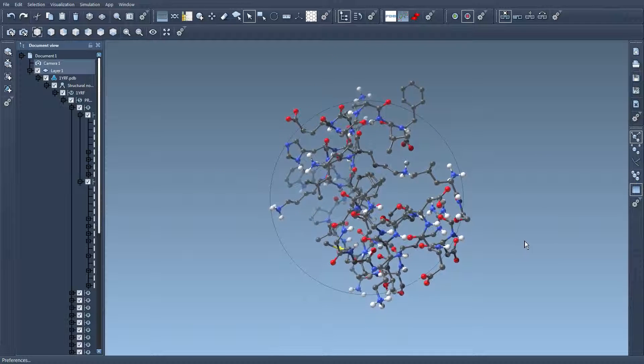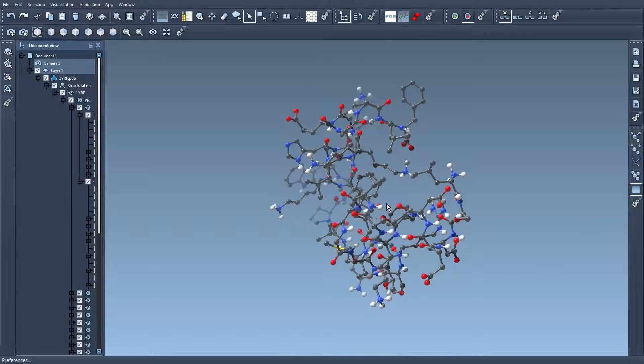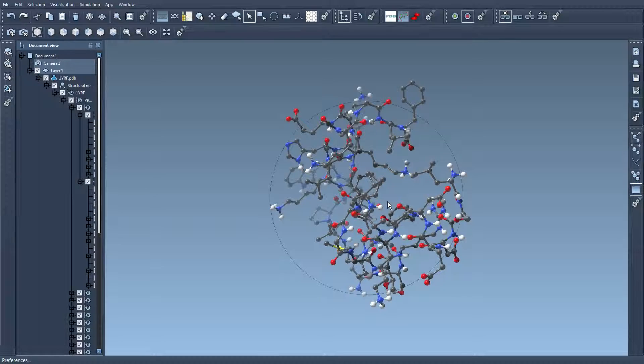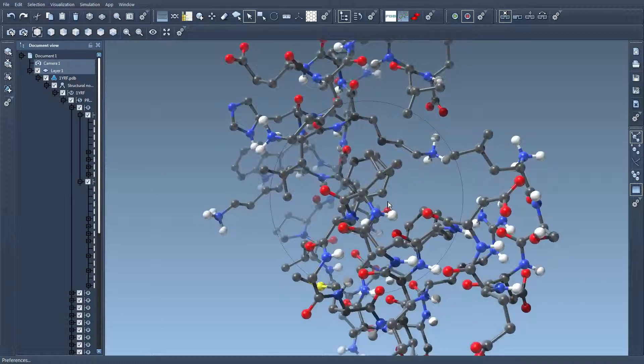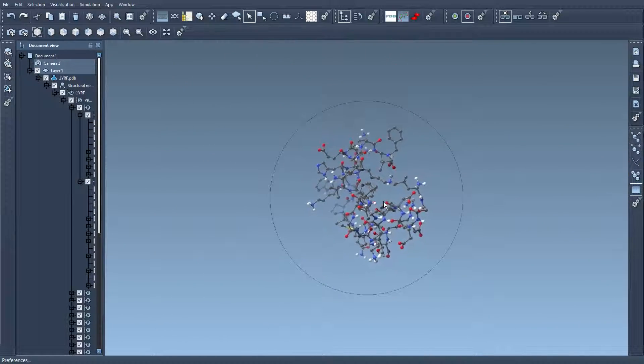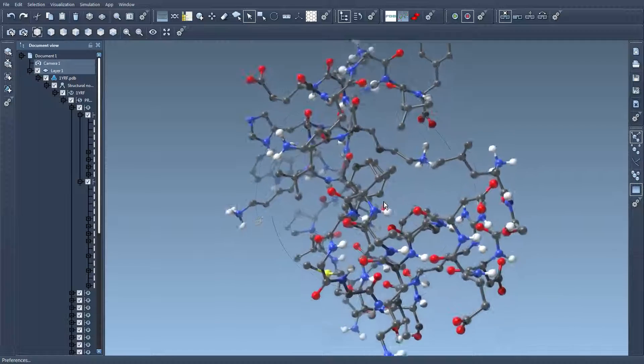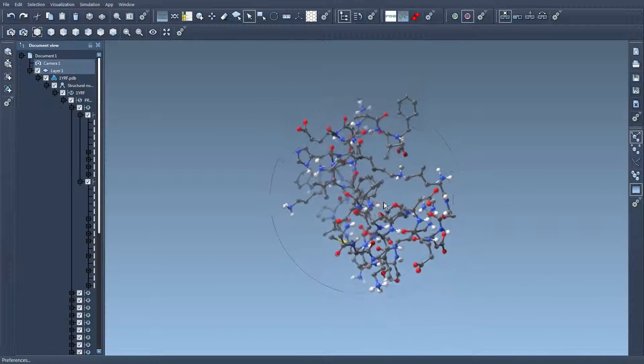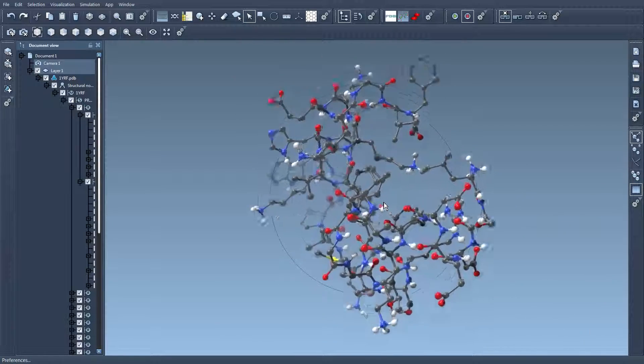And finally if I press shift and I use the mouse wheel then I zoom and unzoom on the molecular system.